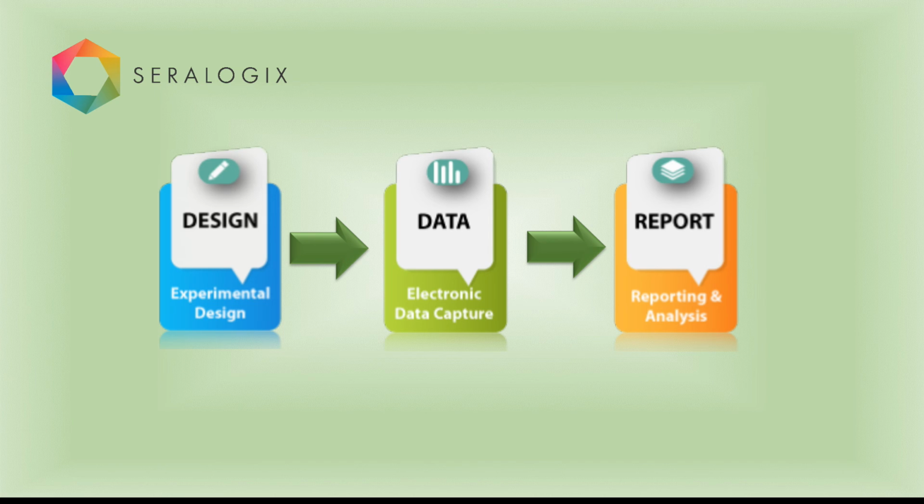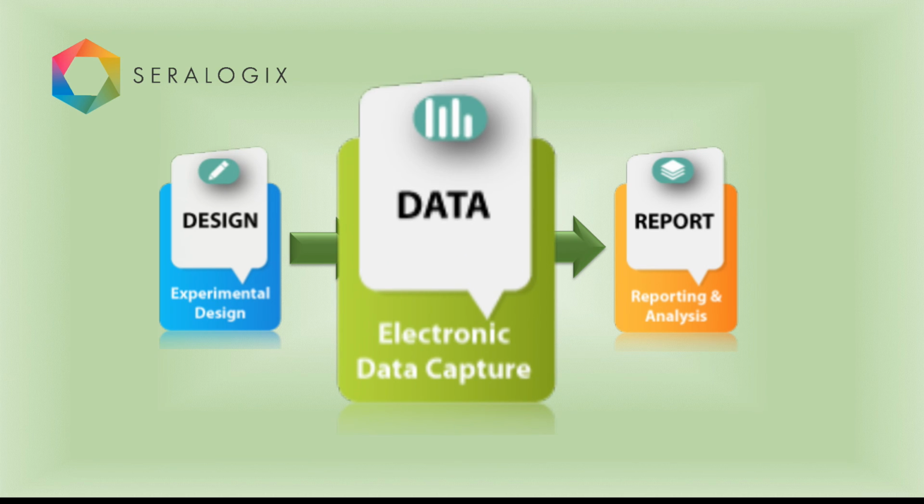Please proceed to view the data collection module demo to see how the design module seamlessly sets up data collection and facilitates the collection of higher quality data.